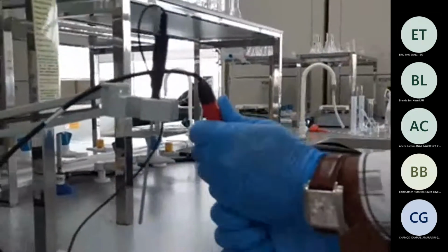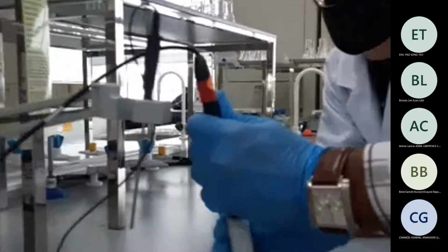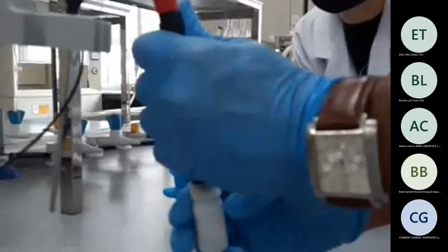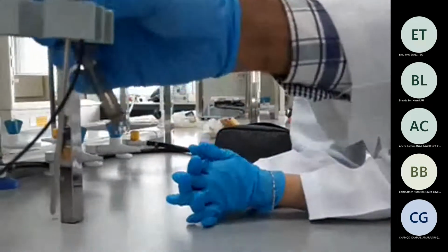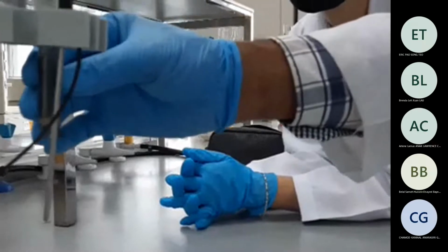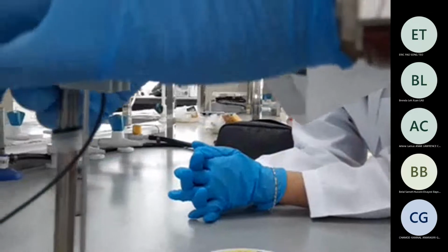So we need to take off this bottle and unscrew it, like this also can. Then put it here and dip it inside.